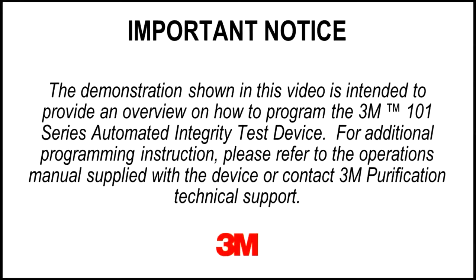The demonstration shown in this video is intended to provide an overview on how to program the 3M101 series automated integrity test device. For additional programming instruction, please refer to the operations manual supplied with the device or contact 3M Purification Technical Support.